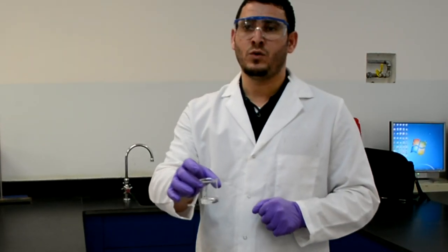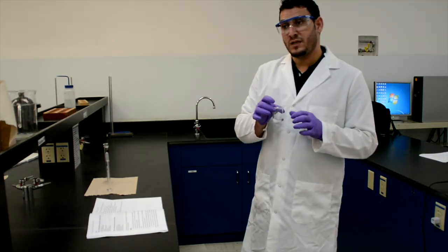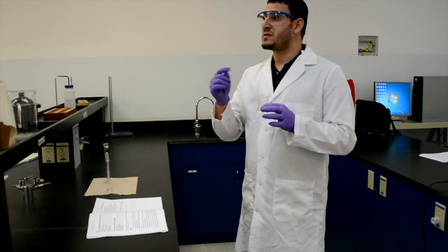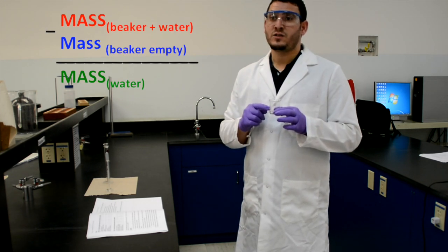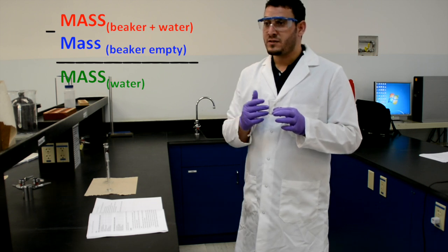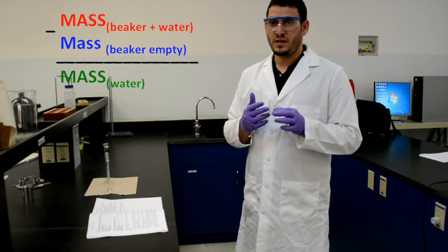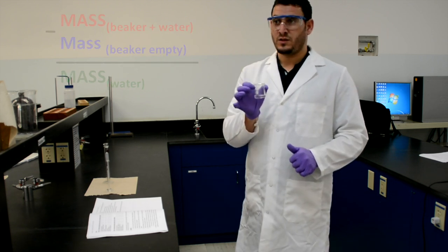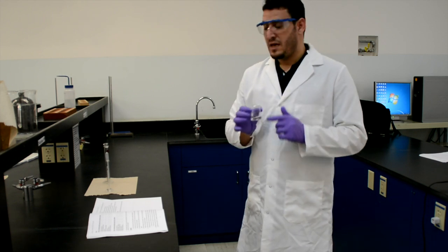To know the mass of the water, I can take the beaker and measure its mass on the scale. But the number the scale gives me will be the mass of water plus the mass of the beaker. So I need to subtract — I need the mass of the empty beaker.